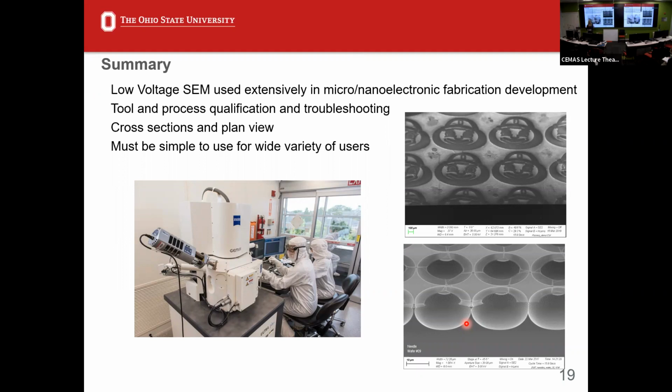And one of the things I stress when we are looking at new SEMs is that, again, we are not microscopists.